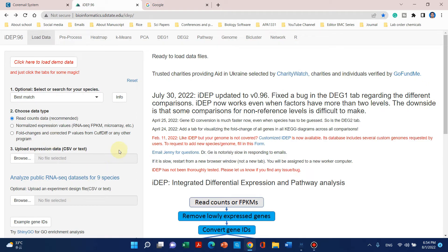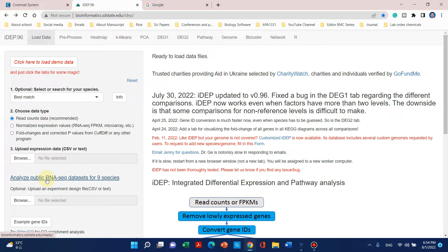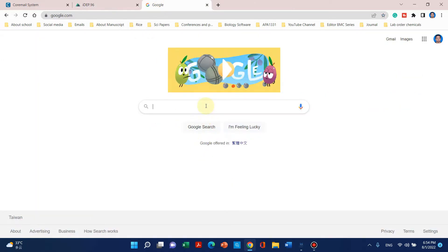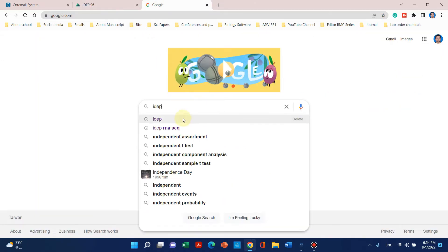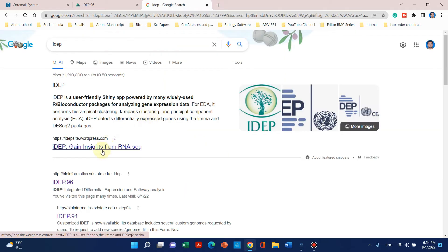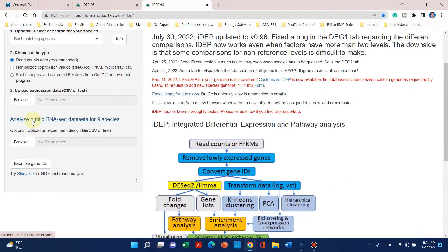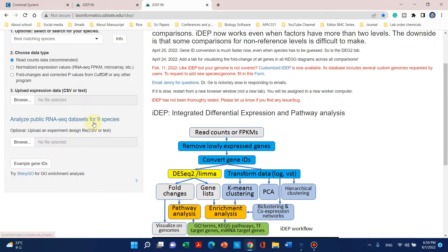Welcome to another video tutorial. This video will be very helpful for those who want to analyze public RNA-seq data. I will show you how we can use the IDEP website to analyze public RNA-seq datasets. To access this website, simply go to Google and search for IDEP, then open the website and go to the 'Analyze Public RNA-seq Data' section.